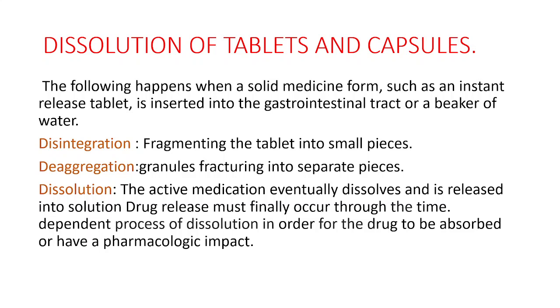It's the first step, fragmenting the tablet into small pieces. The next step is deaggregation, the granules fracturing into separate pieces. The last phase is dissolution. The active medication eventually dissolves and is released into solution.